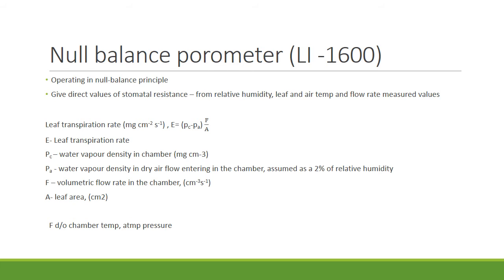As shown in this equation, the calculated leaf transpiration rate directly depends on the volumetric flow rate into the chamber. And this flow rate depends on the chamber temperature and barometric environmental pressure.